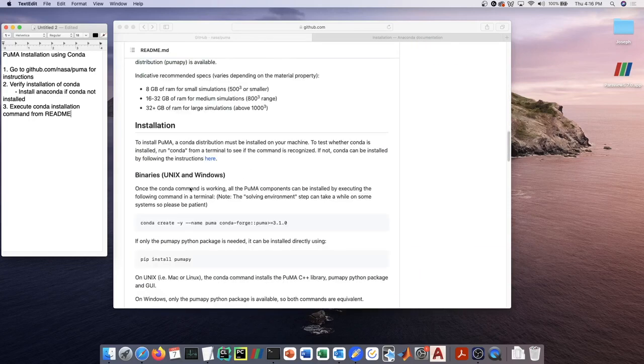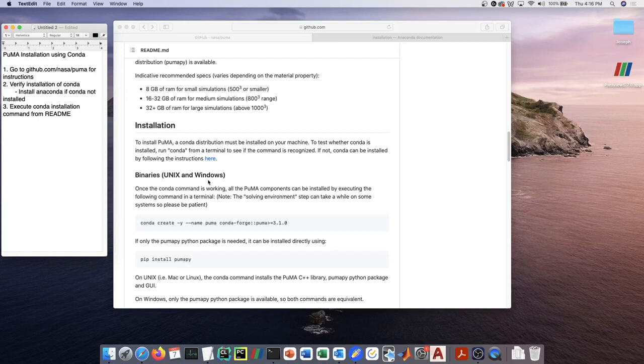Because we use conda, the only dependency that PUMA has before the conda install can go forward is a distribution of conda. There are two different main distributions of conda: anaconda and miniconda.